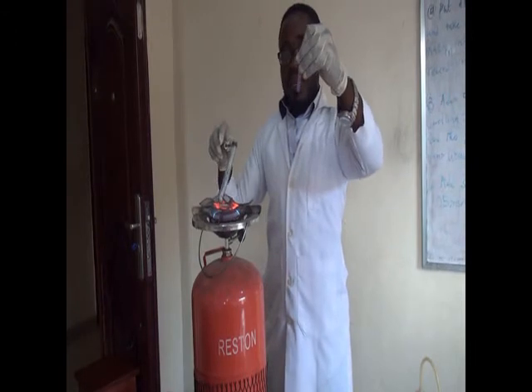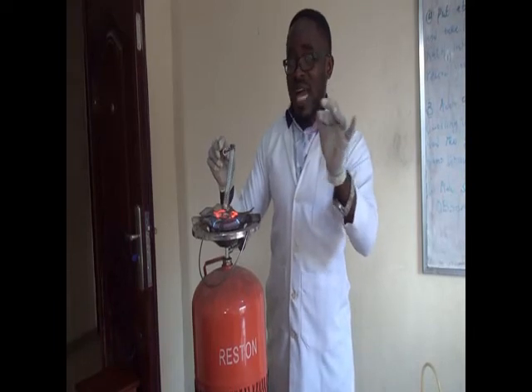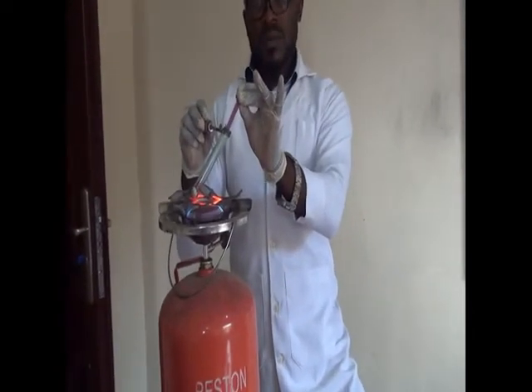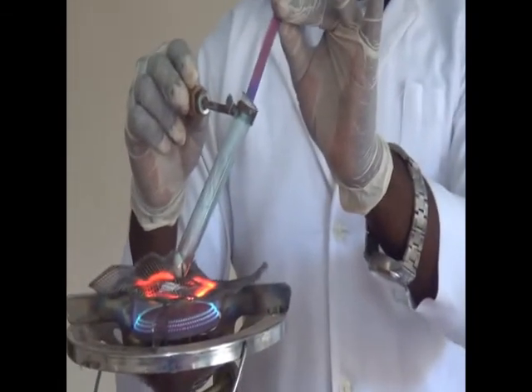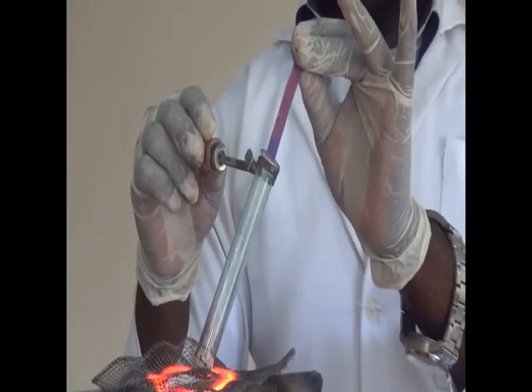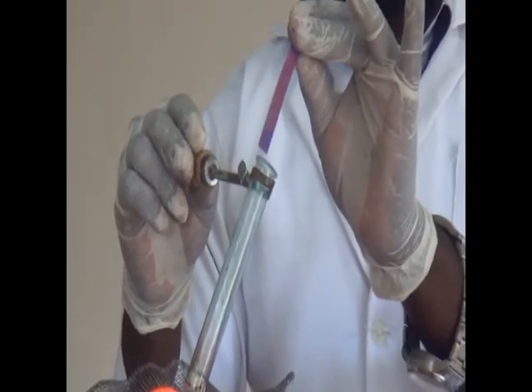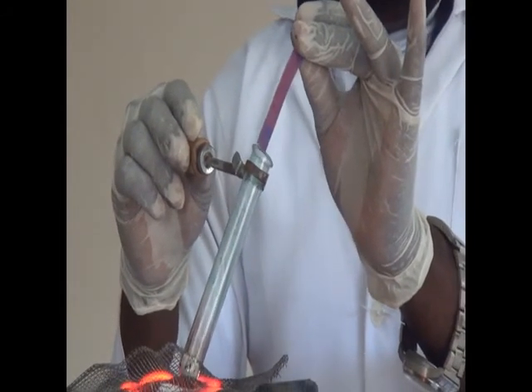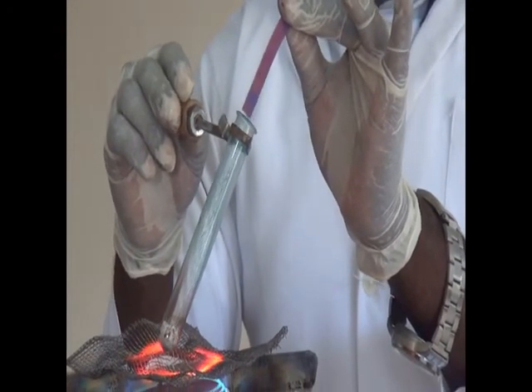The blue litmus paper is wet. That's to say, it's been soaked inside water. We try to see what will happen to this blue litmus paper from the gas giving off there. As we're heating it, the gas is coming up. And look at what is happening at the bottom of the test tube. The color has changed. Continue heating it to a point where you observe a color change in the litmus paper.